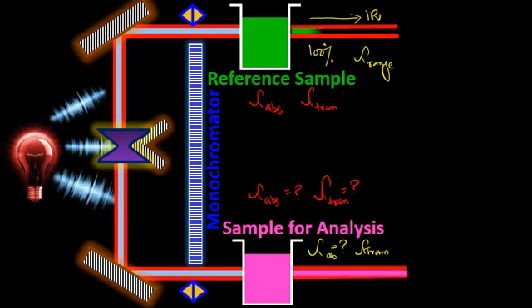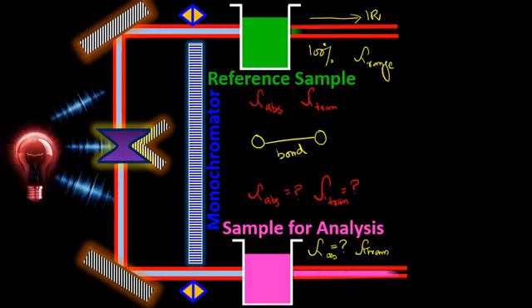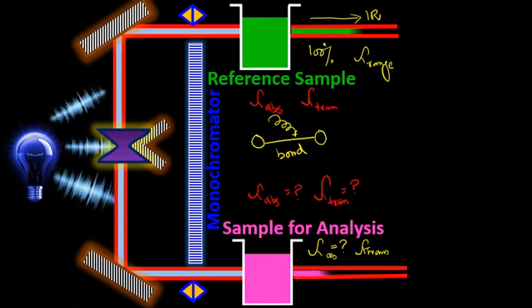Now, the question here is why the sample molecule absorbs the infrared radiation in the IR spectroscope. Basically, molecules have a specific type of bond between their atoms, and when infrared radiations fall on the bonds of those molecules, they cause vibrations.